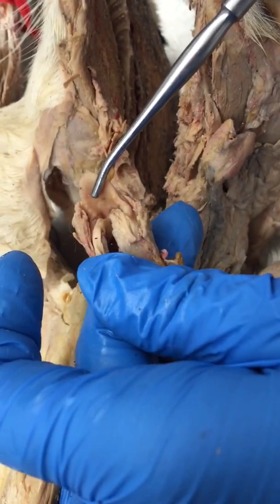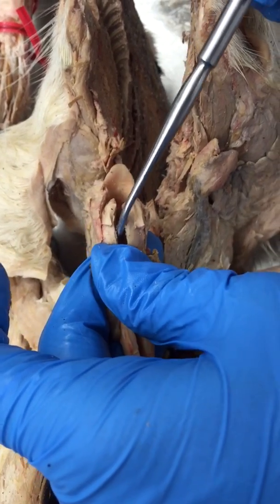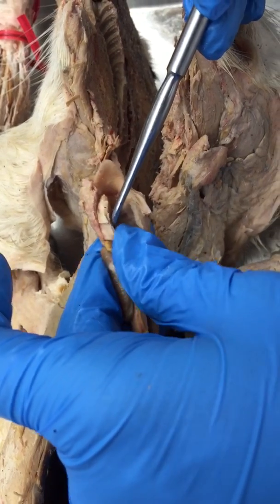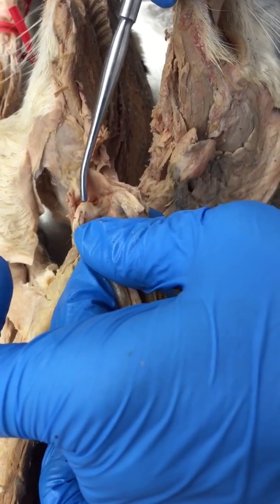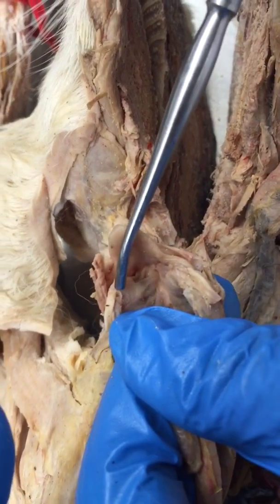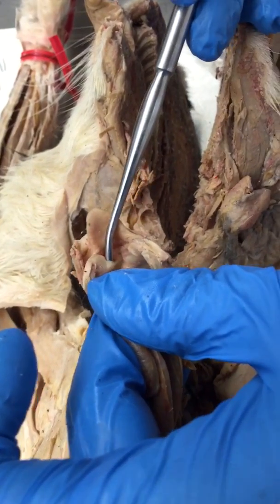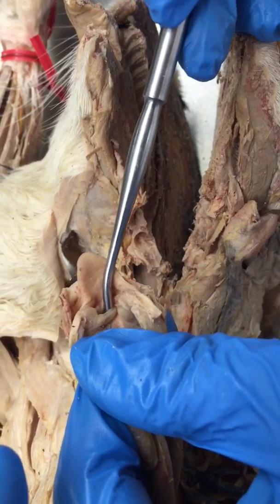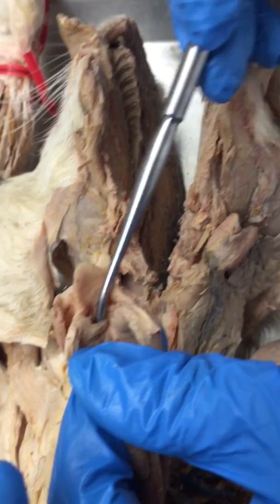I'm going to turn that around so you can look at a posterior view. What we did was cut mid-sagittally along the cricoid cartilage in the back, so all of this is cricoid opened up, and we did that so we could look inside. This little triangle right here is the arytenoid cartilage, which happens to attach to the true vocal cord. This little pocket that I have my probe in is the true vocal cord, or the vocal fold.